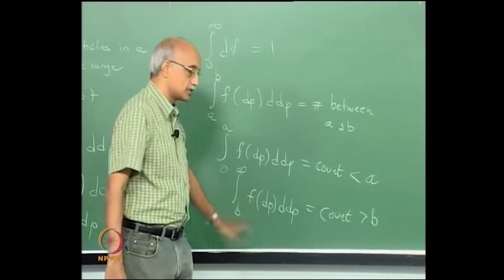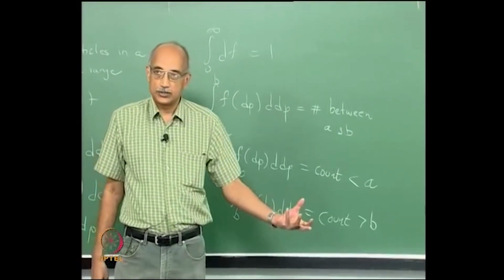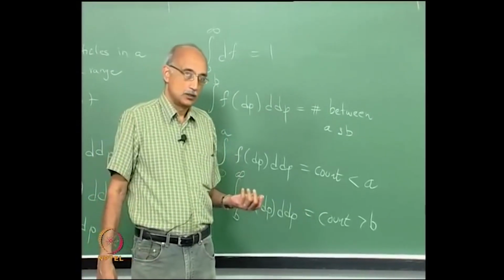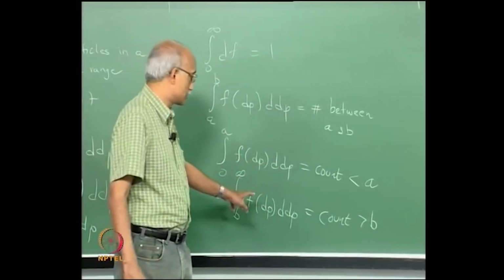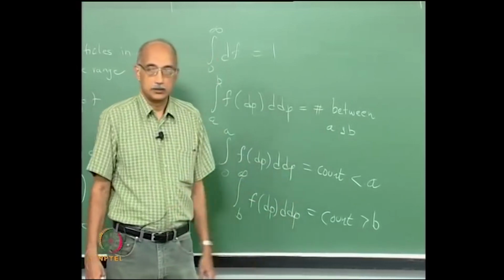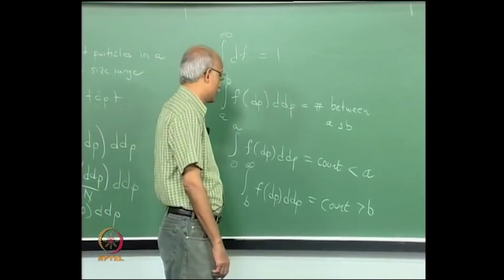And again, in most manufacturing applications where coarser particles cause you more problems than finer particles, this way of calculating counts is much more applicable and relevant.